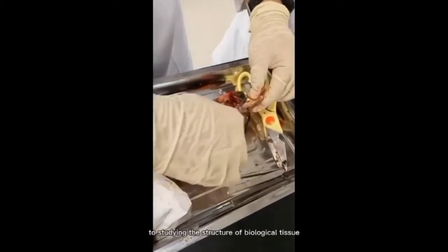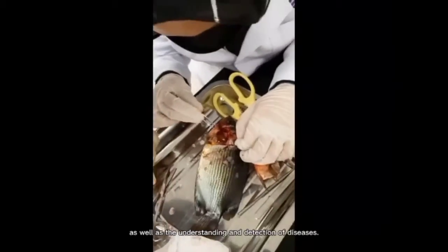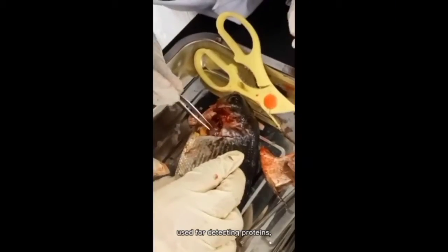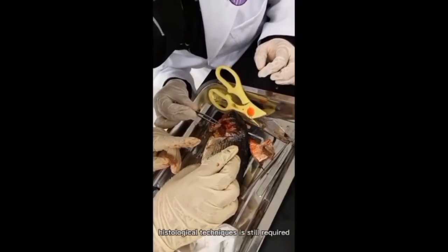Histology is vital to studying the structure of biological tissue as well as the understanding and detection of disease. Although more and more histological staining techniques used for detecting protein, lipids, and nucleic acid have been developed, histological techniques are still required in this field.